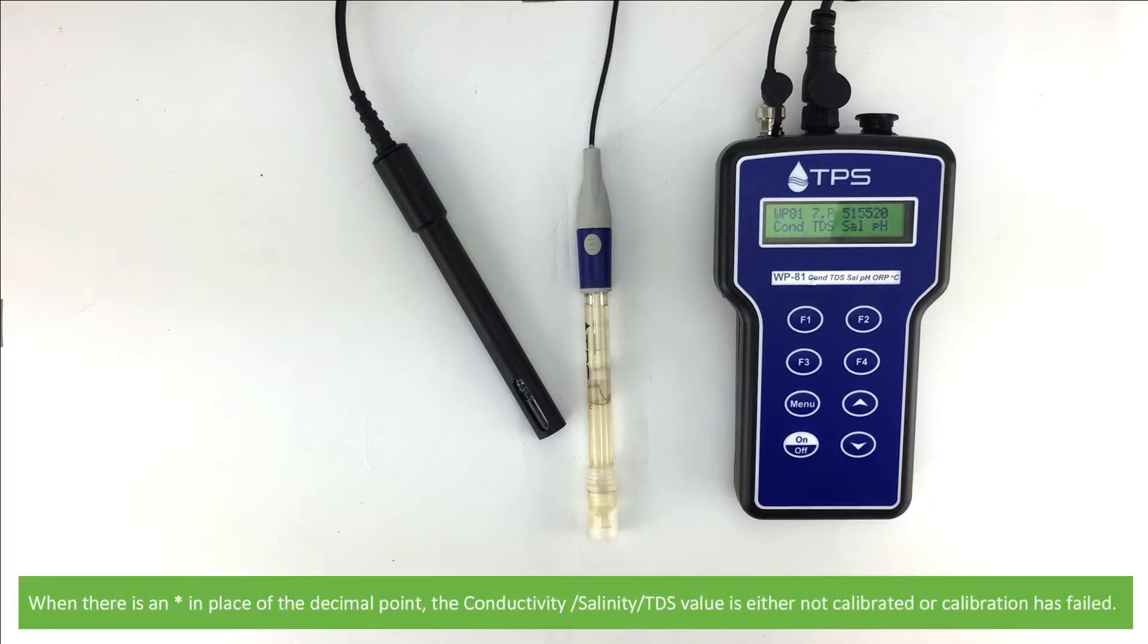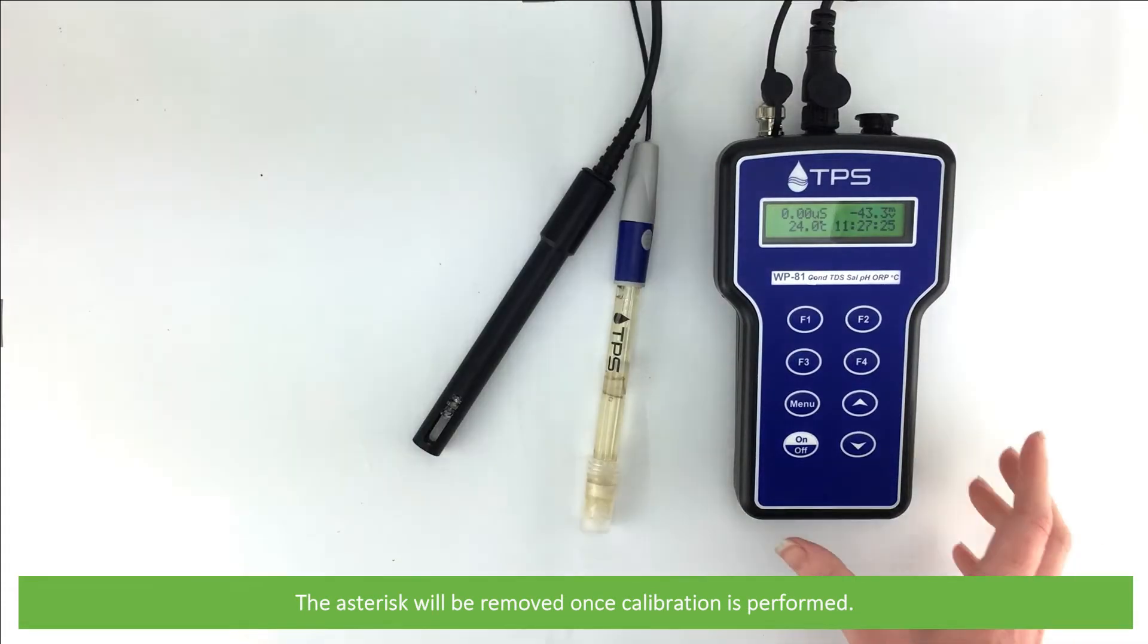When there is an asterisk in place of the decimal point, the conductivity, salinity, or TDS is either not calibrated or calibration has failed. The asterisk will be removed once calibration is performed.